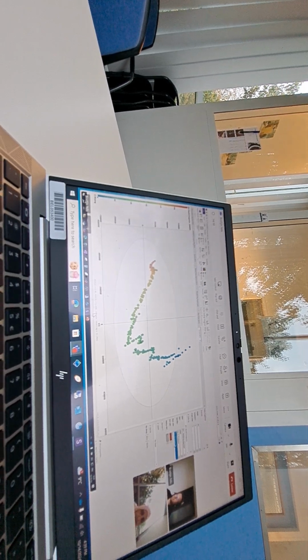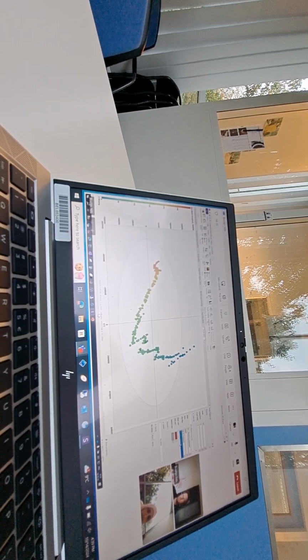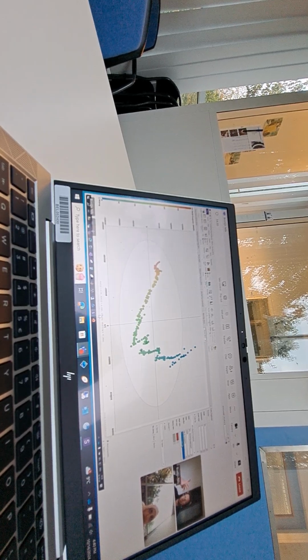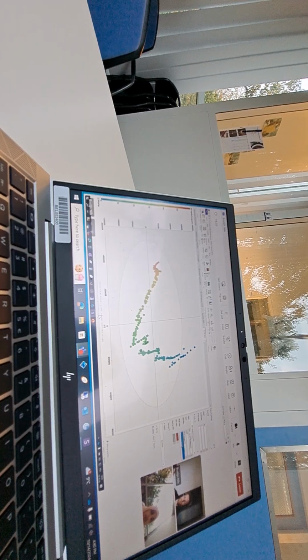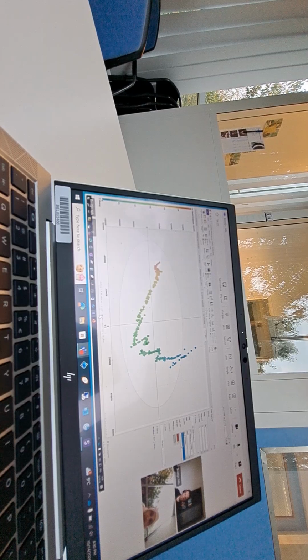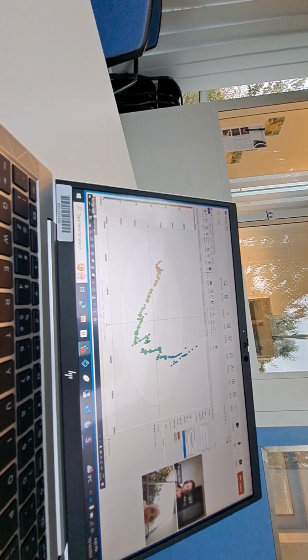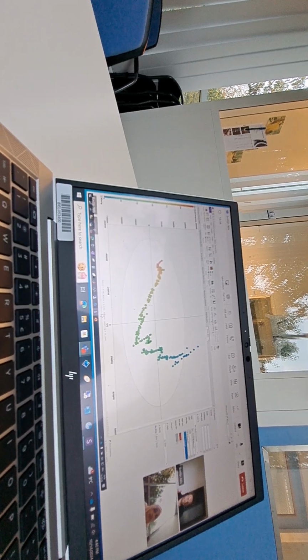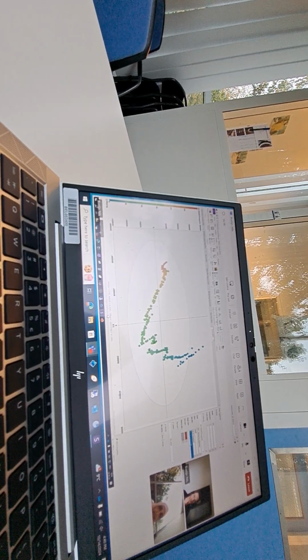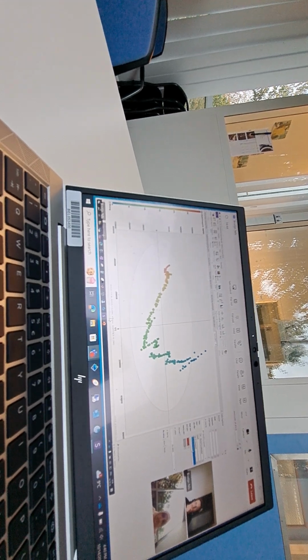Here we only have time point, but you could do it for the XRPD results, and then you will have three color codes for the salt plus free base and the free base. Or for the pH, you could also have it, and then it will be colored according to the pH. So you can add as many secondary IDs as you want. There's no impact on the spectra. It's just easy to color according to that information.